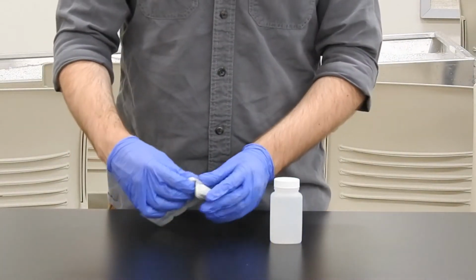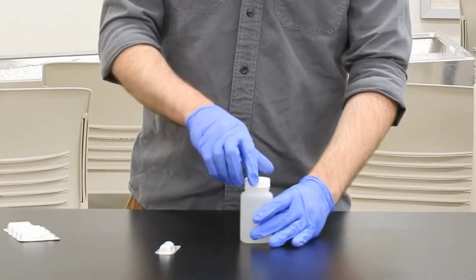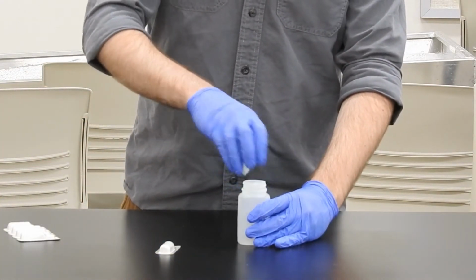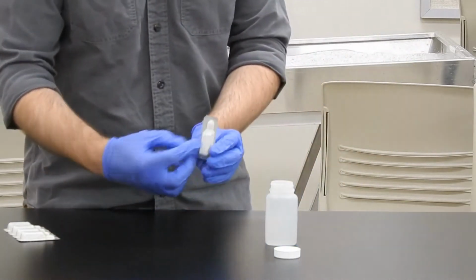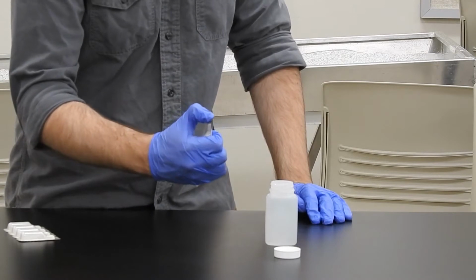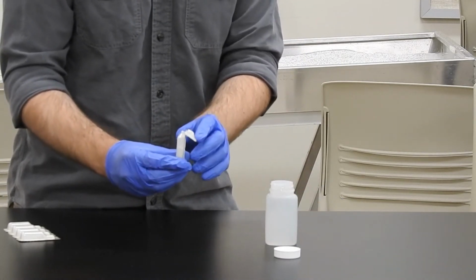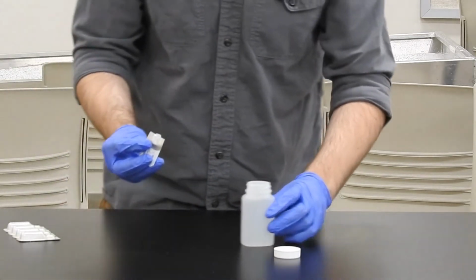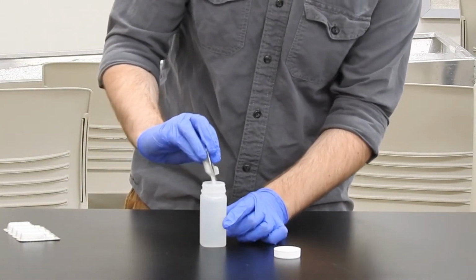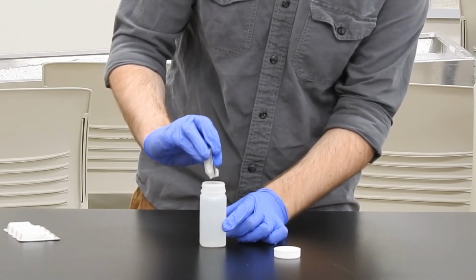After you've pipetted the water, the next step is to add one of these powder reagent packets. It's hard to see in the shot here, but in the upper portion it's perforated so that it can be easily opened. When you open it, you want to hold it away from yourself and use your thumb to push on the top to break that perforation. You can then fold it and make sure that you dump all of the powder into the sample. You can gently tap the top of the bottle to make sure that you shake out any remaining powder.